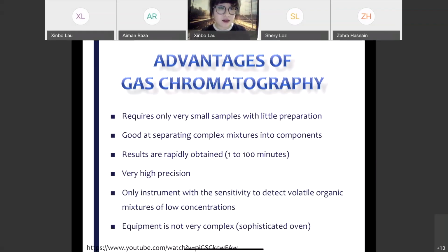This is also important for you to notice. Later I'm going to show you what the chromatograms look like, and normally the x-axis is in minutes. So you run the separation, and you get separation within, say, 2 to 10 or 15 minutes, which is reasonable.